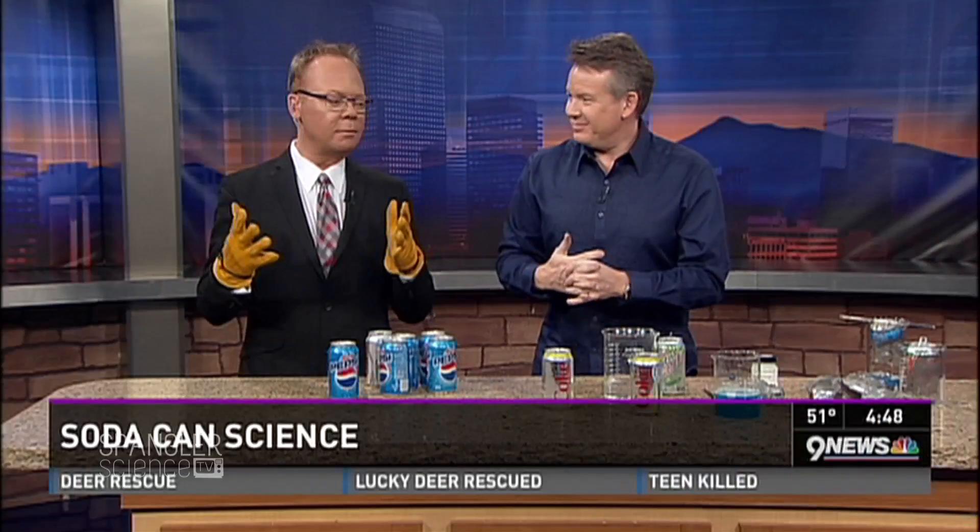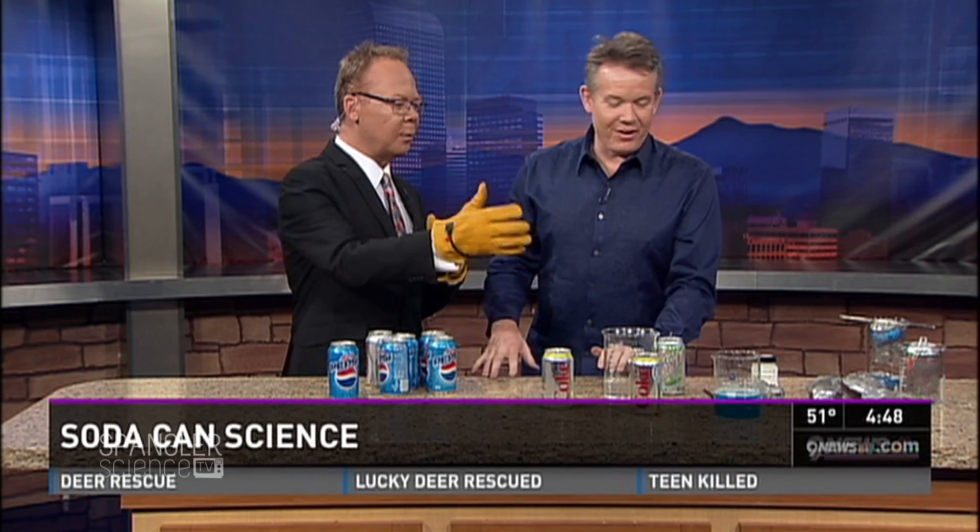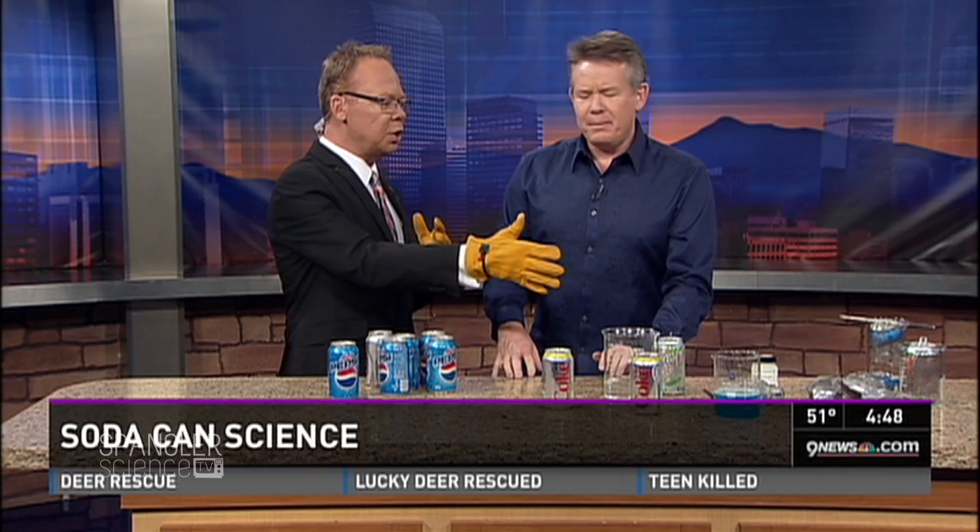Time for Spangler Science. I'm wearing gloves, we have chemicals. Welcome to the table. There's a blue liquid. Don't worry about any of that stuff — it looks like there's been an explosion. It's fine. This is to showcase your strength.